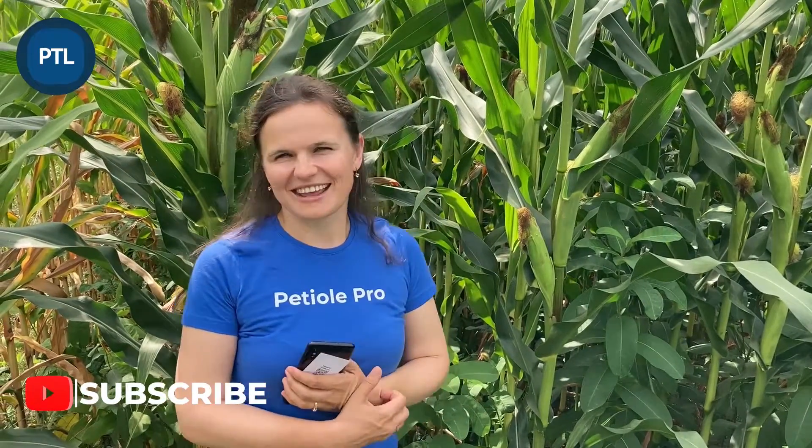So let's start with a leaf greenness index. I understand that this corn is quite big for real-time estimation of the greenness of leaves, and probably these measurements we will get will not be definitely relevant for some actions regarding this corn, but at least I will show you the algorithm of how to do it properly, and you will do the same with your corn or with your crops on any stage of their development.